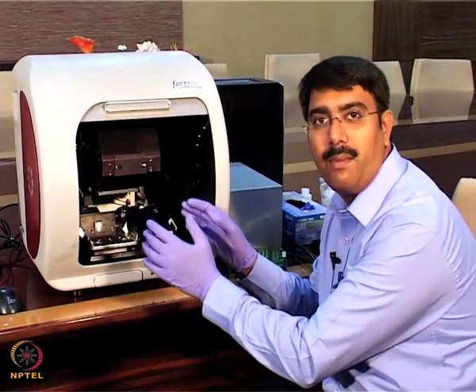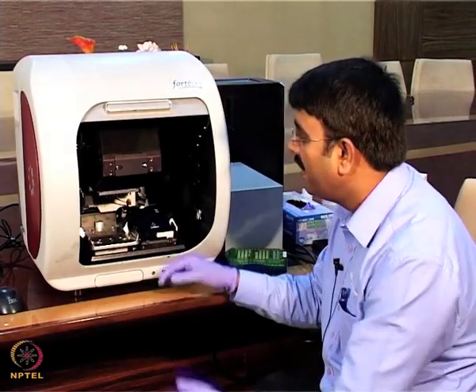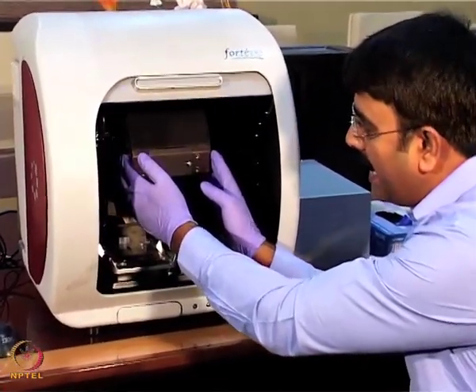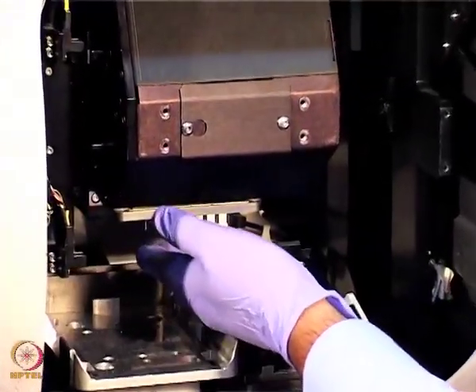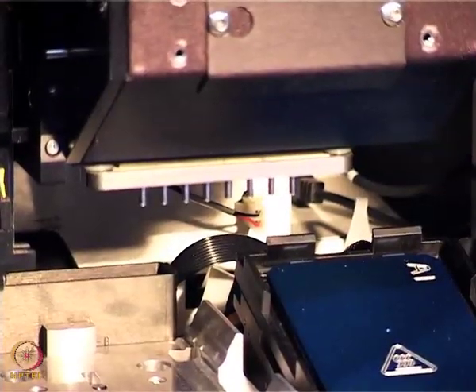This is the Pall ForteBio Octet RED96 instrument. If you look inside, this is what we call the optical head box. The optical head box consists of a spectrophotometer as well as the channels, or what we call a manifold. This is an 8-channel manifold, so it can take up 8 sensors.